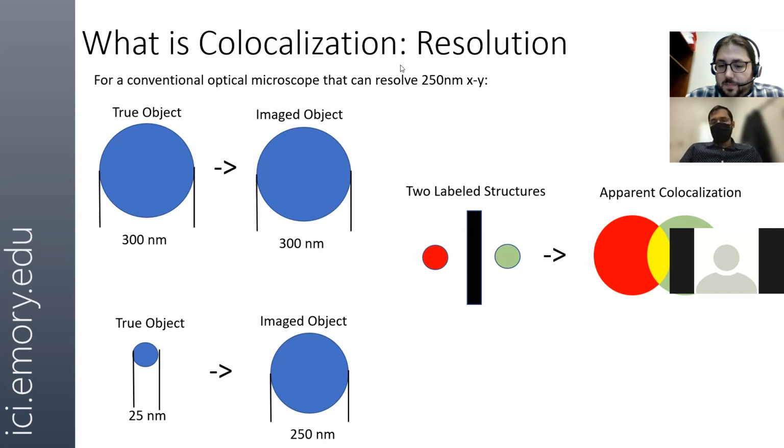And if I may add one more thing to that, let's say you have one protein, for example, the green in color is cytoplasmic, and on top of that, you have lysosomes, which are part of the cytoplasm. If you were to run a colocalization analysis, of course your lysosome is part of cytoplasm, but that doesn't mean they're co-localized because they're completely two different compartments.